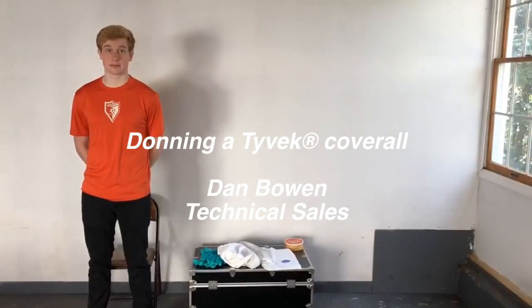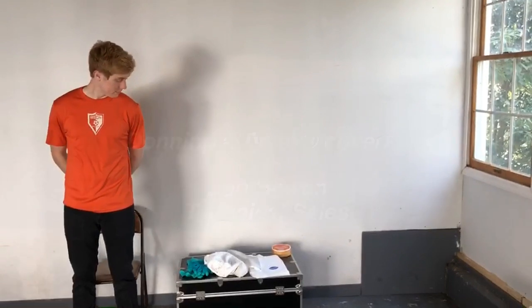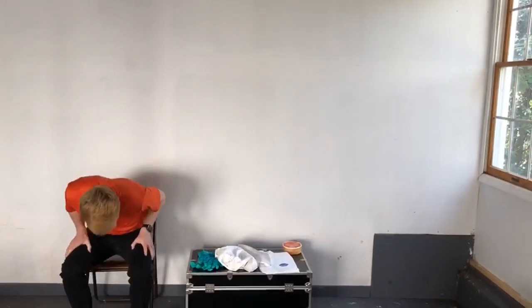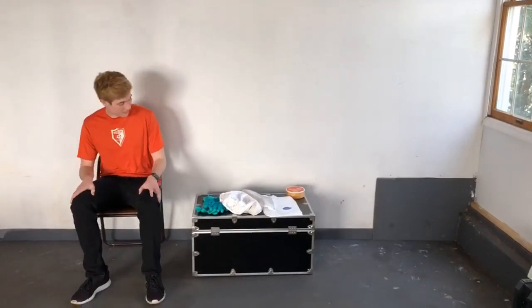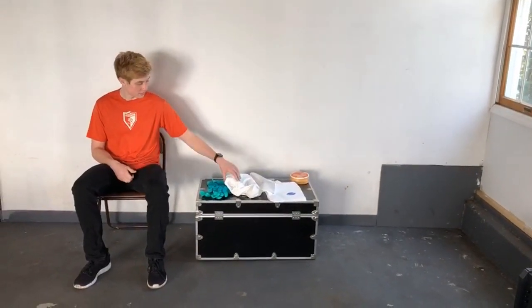Hello, my name is Dan, I'm with DuPont Personal Protection, and in this video we're going to review the donning procedures for a Tyvek protective coverall. This is going to be a self-donned garment — my assistant Matt is going to demonstrate. We have a chair behind Matt; it's always a good idea to have a chair available for both donning and doffing protective apparel, whether that's general protection garments or Tychem chemical resistant garments.